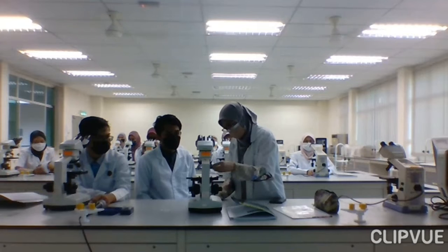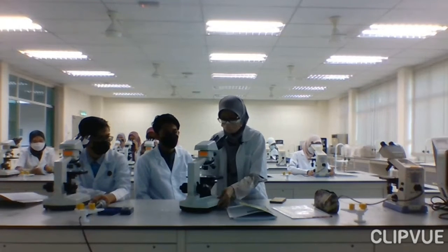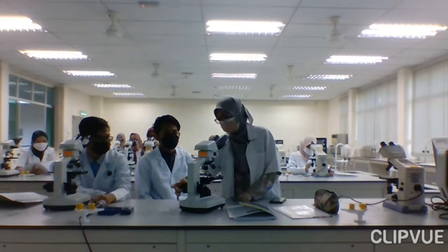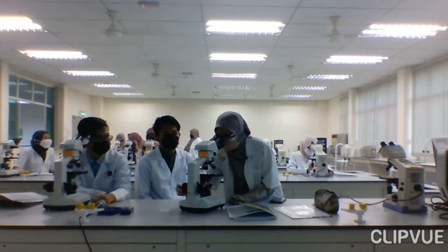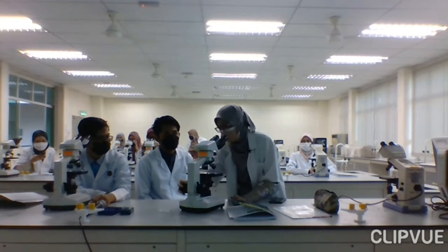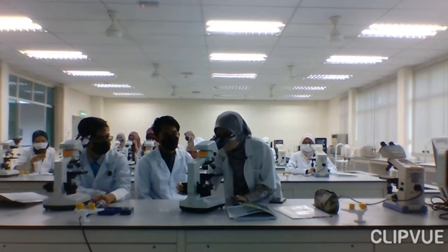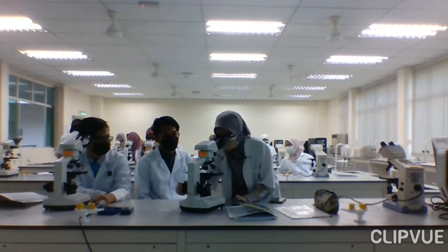The stage should be at the lowest first. This is the four times. So we use the coarse knob. Turn it clockwise slowly until you can see the image. You still can't, so you still need to turn it. It's just a little bit more like that. So you see how it looks.